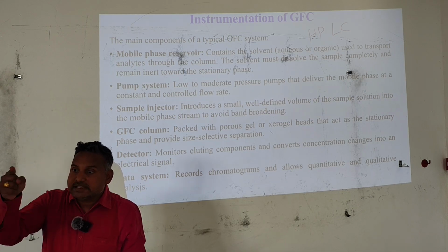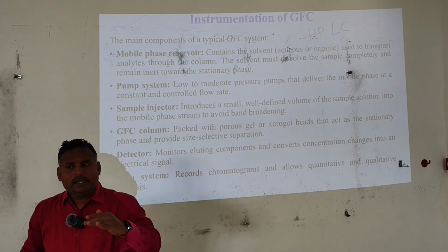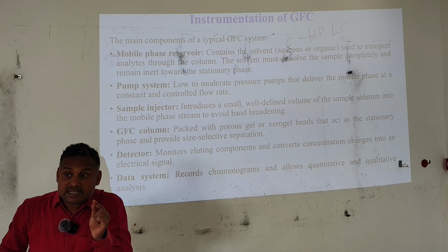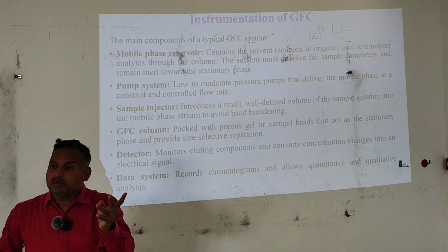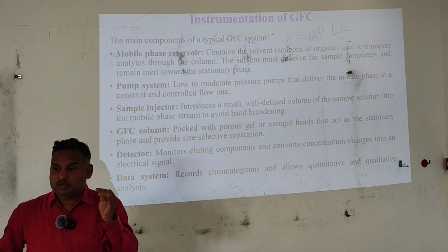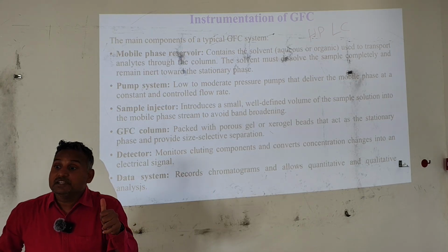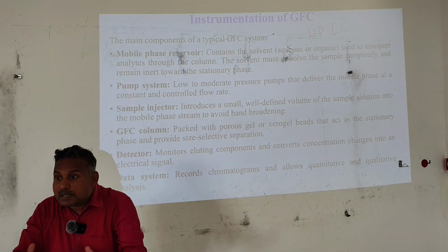Are you getting it? So HPLC is not a single technique. We have LSC, LLC, ion exchange, gel permeation or gel filtration, size exclusion, and also affinity chromatography. But the instrument remains the same.